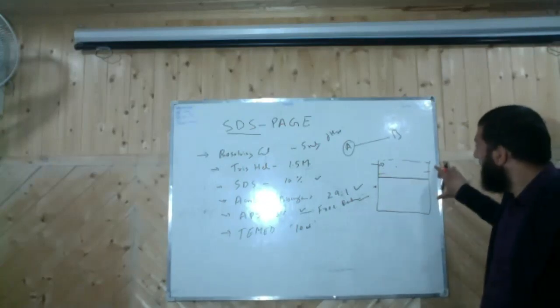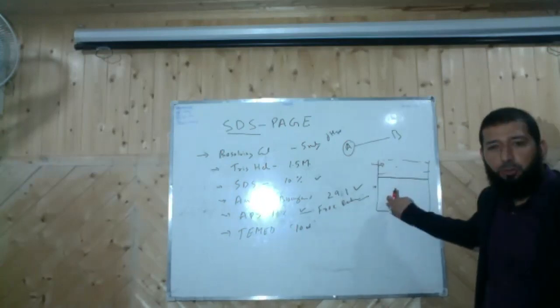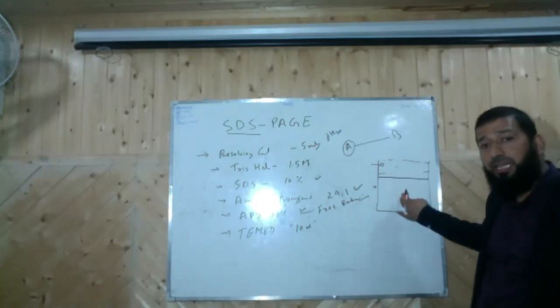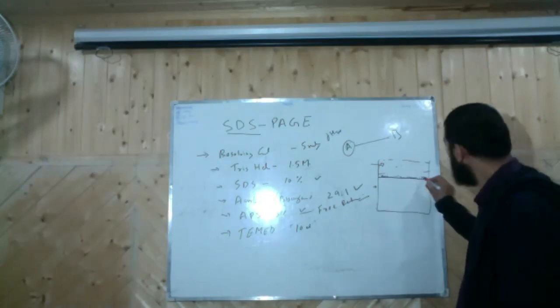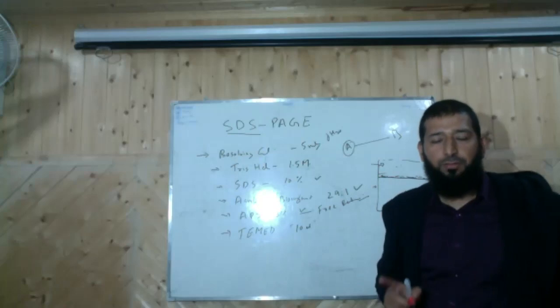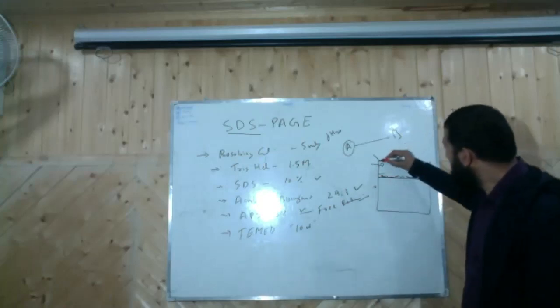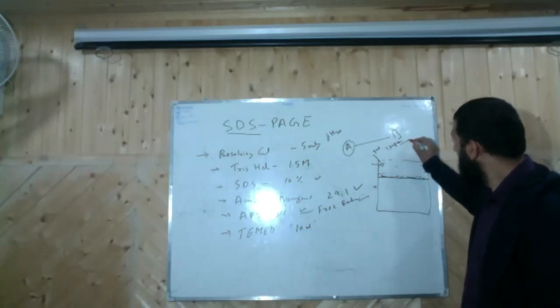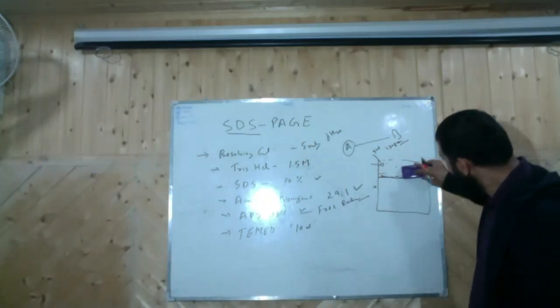Okay. Then once we add this, we do not want any oxygen bubbles or oxygen in contact with the gel. Plus, when we pour the gel, there is bubbling or froth formation. That's not good for a good gel, for a good experiment. So we need to remove it. How do we do it? We add, say, 50 microliters of isopropanol. Once we pour the isopropanol, these bubbles disappear.